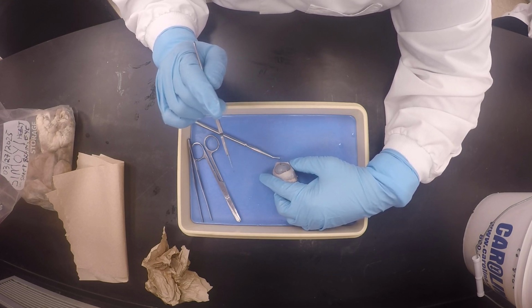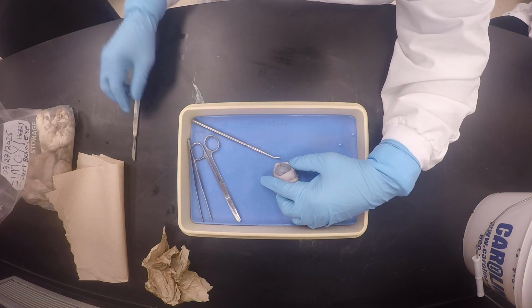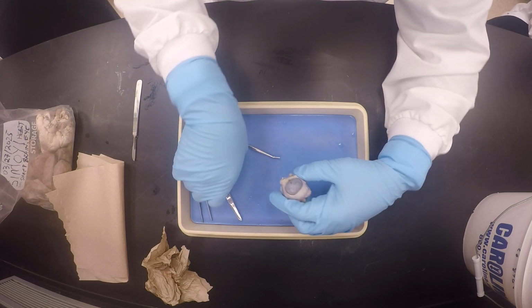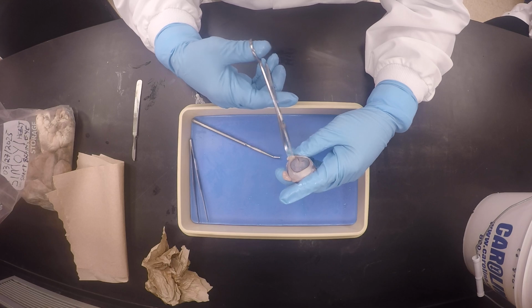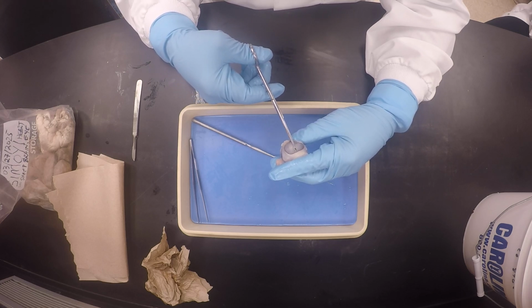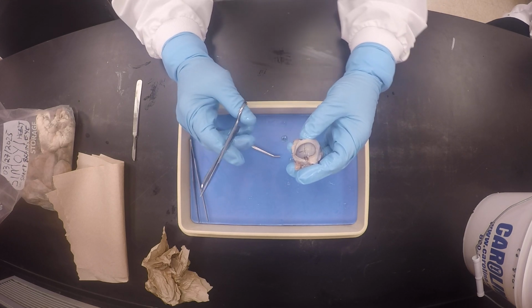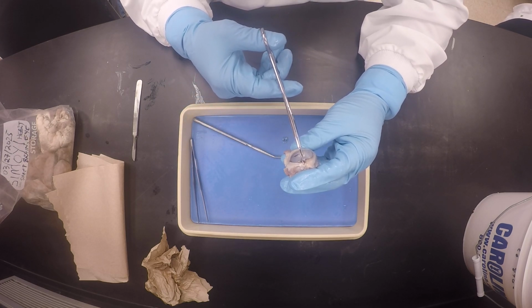Oh, this is a sharp one. Oh, I cut it like this. Most of these scalpels are so blunt that you will be putting all sorts of effort just to cut it. Did you see what I did? I just made one small incision there, and I'm using my sharp end here because there's not a lot of space in there. But this thing is thick and it's hard. You think the eye is a delicate organ, but that thing is so tough. It's amazing how tough the cornea is.